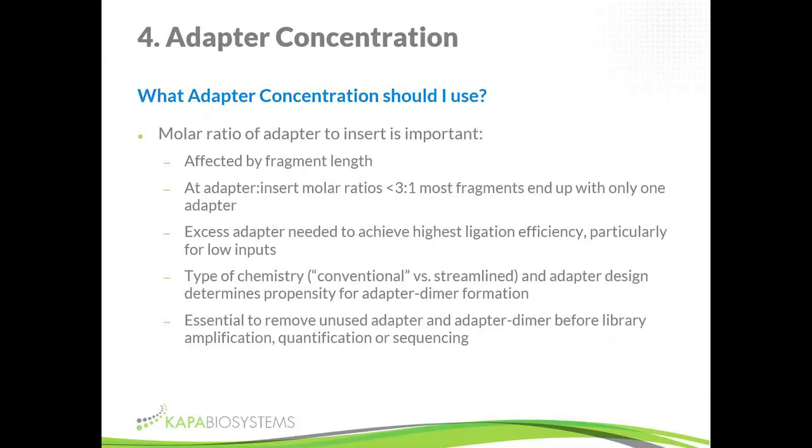When you have a problem, it's very important to get rid of adapters and adapter dimers, because adapter dimers specifically will amplify very efficiently, and they might take over a library amplification reaction. They cluster very efficiently, so they take up real estate on your flow cell. So it's really important to get rid of them.